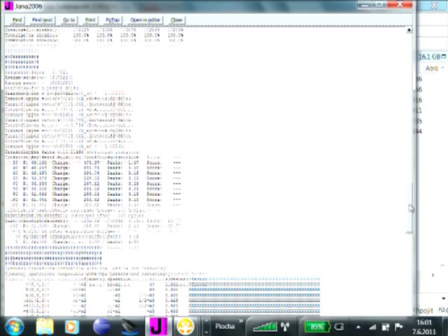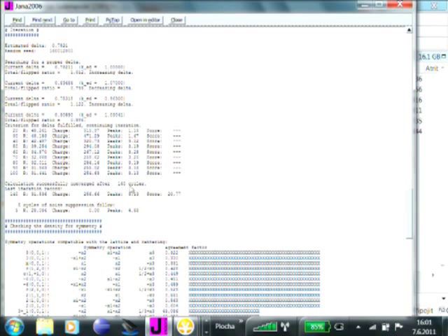Then we have the iteration part, and after 140 cycles, you see a message, calculation successfully converged. If you see this message, it means that the program believes it found convergence. Nothing more, nothing less. Sometimes, if the program does not see the convergence, it can still be there. So it's worth checking the result even if you don't see this message, even if the maximum number of cycles is reached. It's always worth checking.